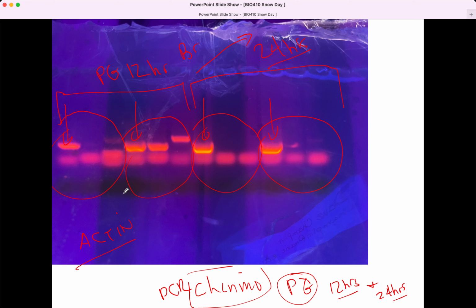Okay? And so when I added the enzyme, you guys set up the tubes, and at the end of what you set up, there should have been 49.5 microliters in each tube, and then I add half a microliter of the Taq DNA polymerase to do the copying during the PCR process. That's the enzyme that does the DNA copying, and it's added right at the end. I have to add it under special conditions, just to get everything started, and it's just a tiny amount of material. I use a different pipetter with different tips to add such a small volume.